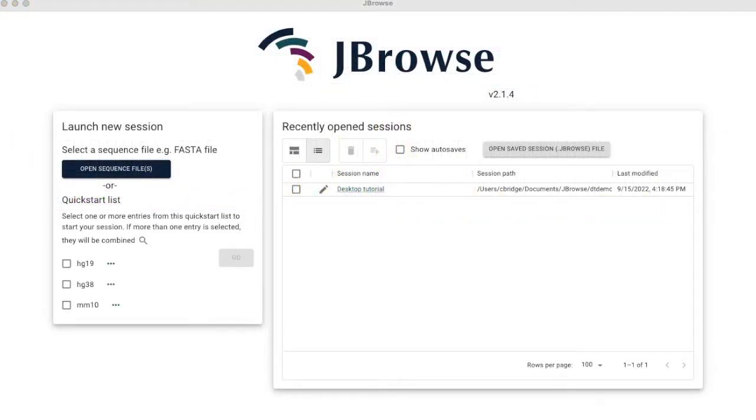We've looked at the multi-quantitative track type in JBrowse 2 and reviewed how to populate our data into this view, as well as how to use the various visualization options available to us with this view type. With a variety of customizable visualization options available to it, the multi-quantitative feature in JBrowse 2 is a powerful tool for visualizing complex datasets.